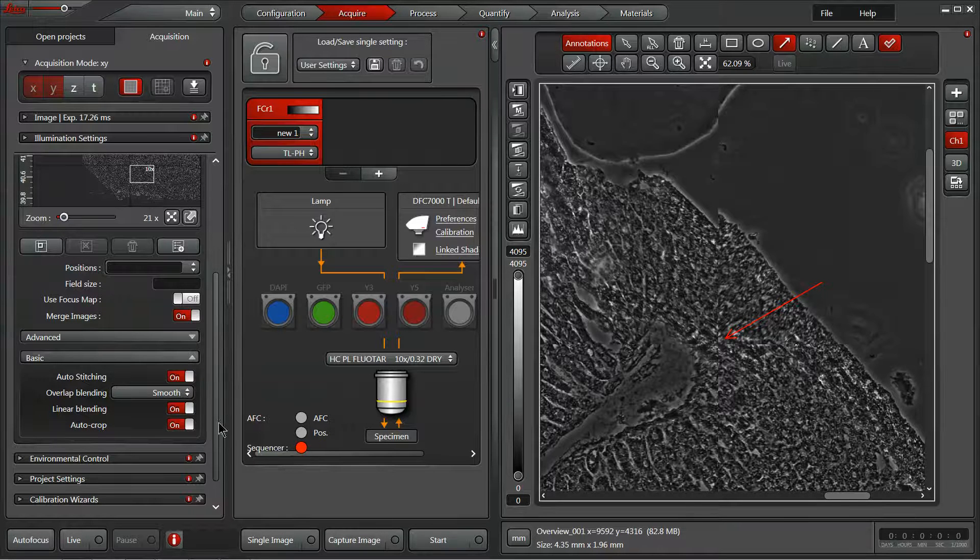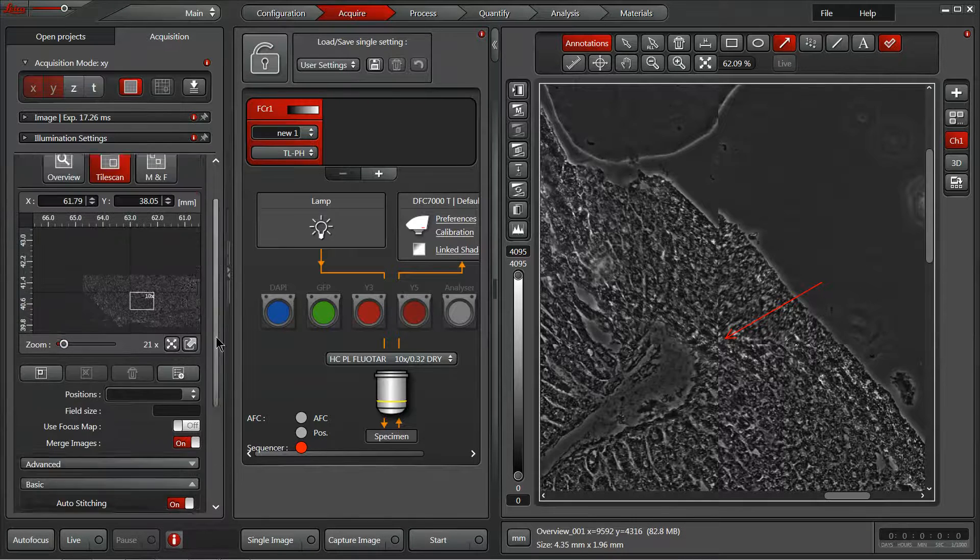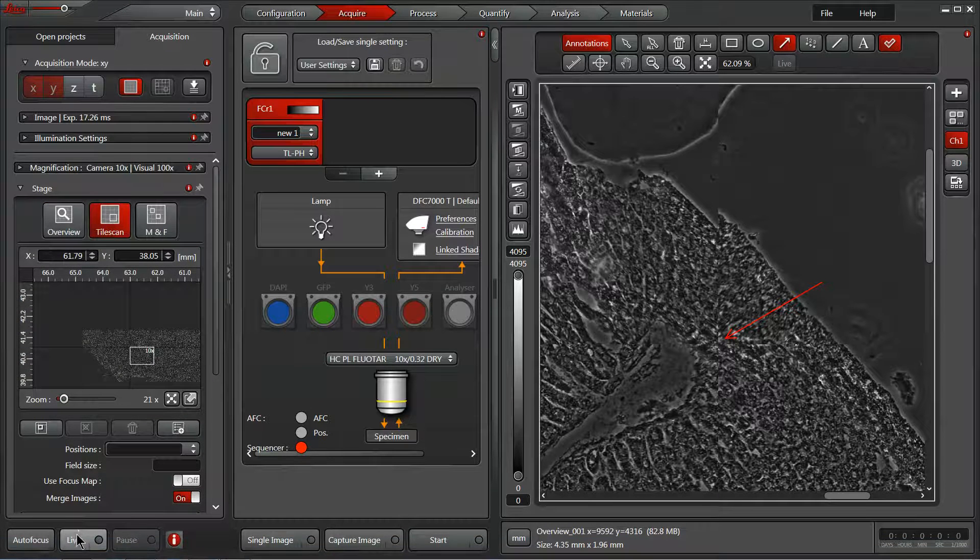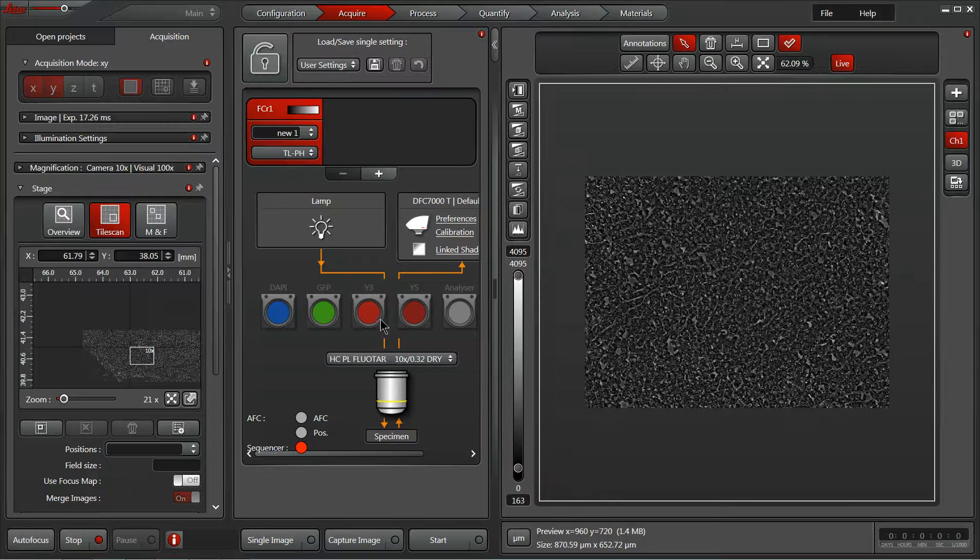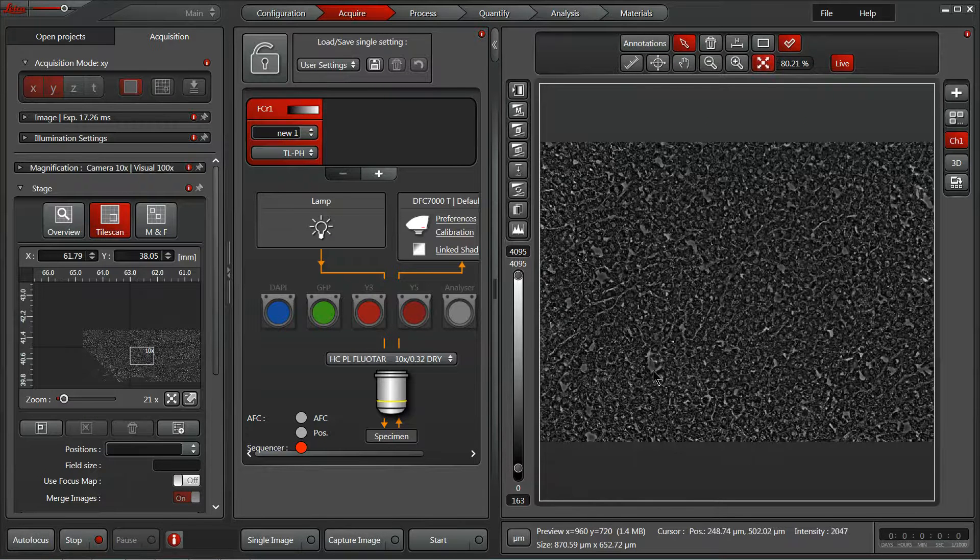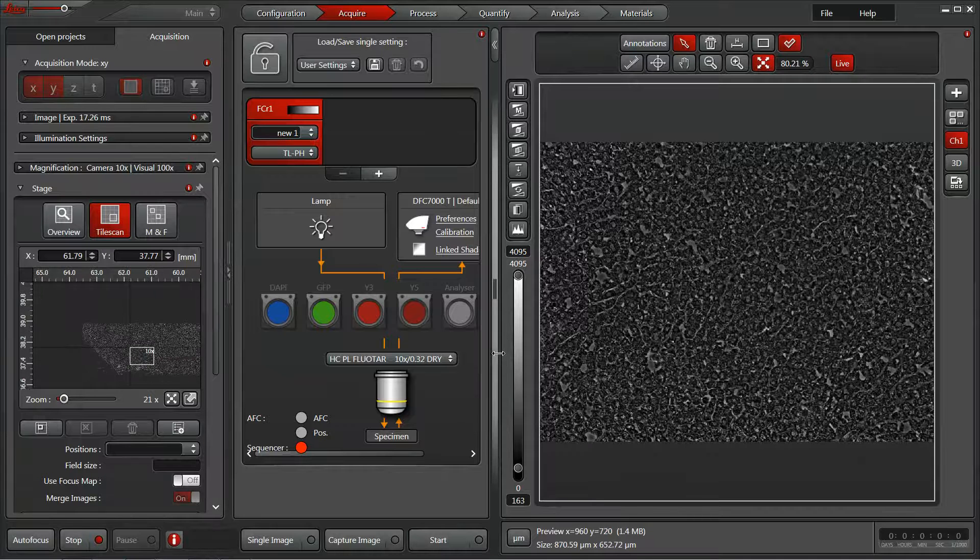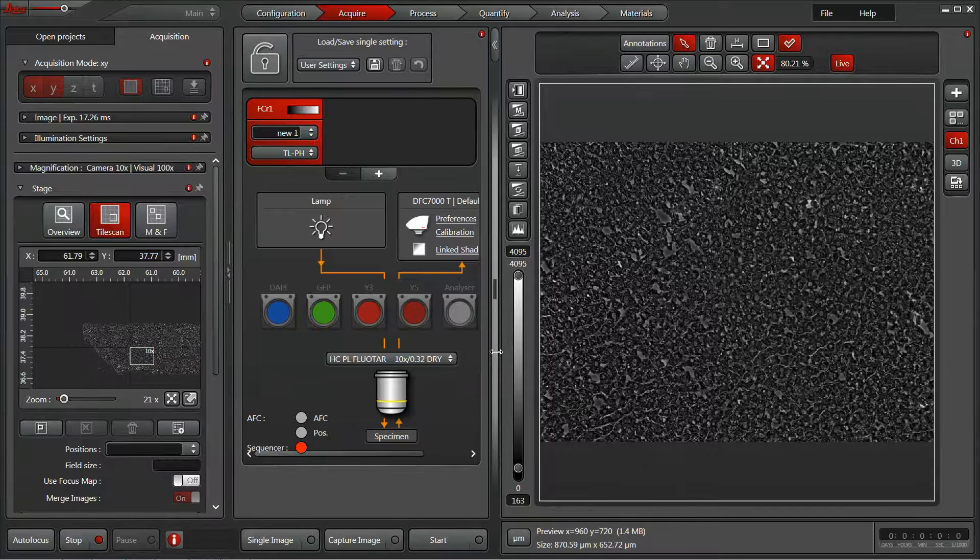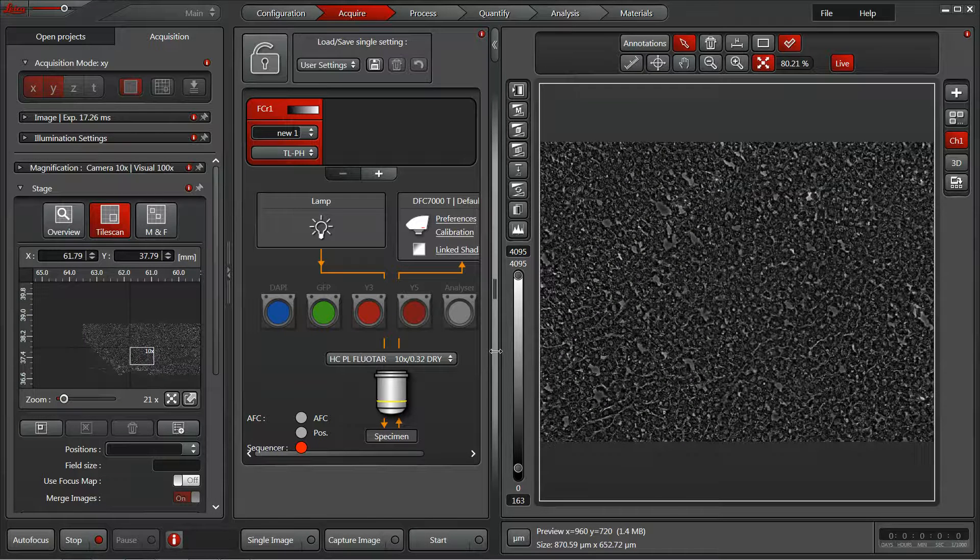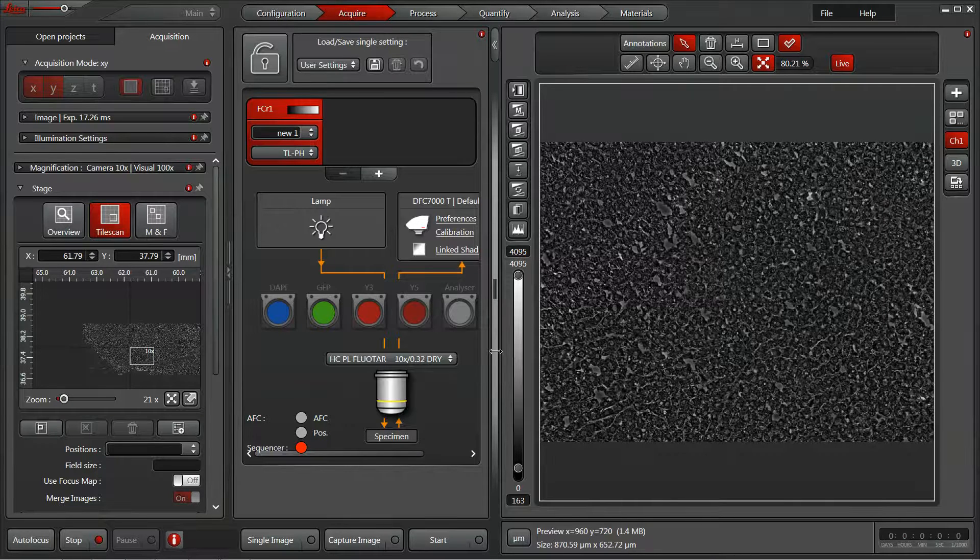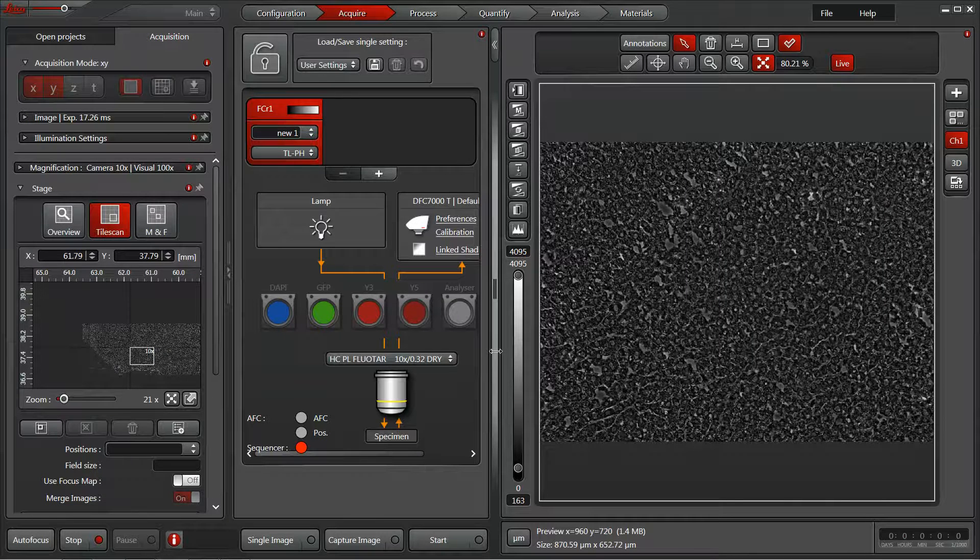So to set up a tile scan, we can hit our live feed again on our camera. I'm going to best fit that window here with the click of this button. And now, similar to our overview, we could mark the top left, the bottom right of our field that we'd like to capture.